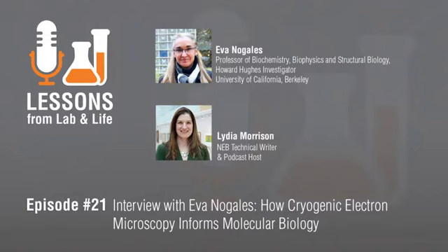I was hoping that you could tell our audience what cryo-EM is and how it informs biological studies. Very good. So cryo-EM, which stands for cryo-electron microscopy, is a modality of this technique that has been used for many years to visualize objects at high resolution using electrons instead of light, but where the cryo refers to the fact that the sample is frozen.